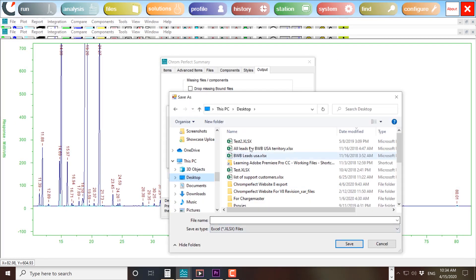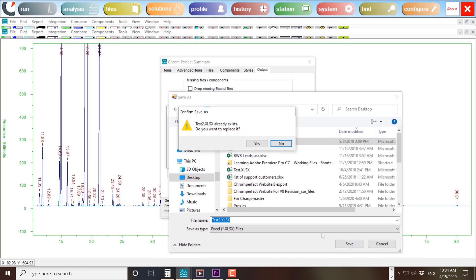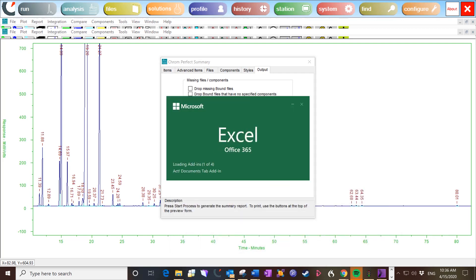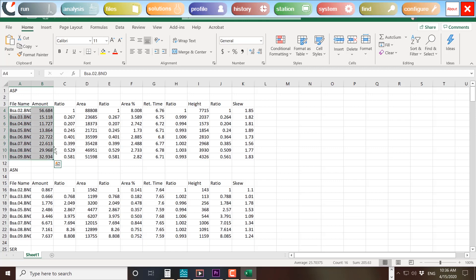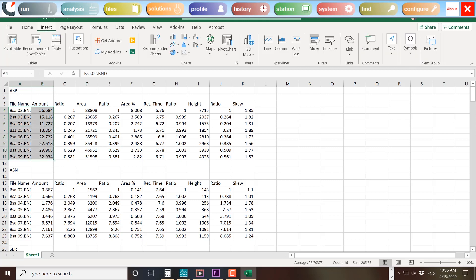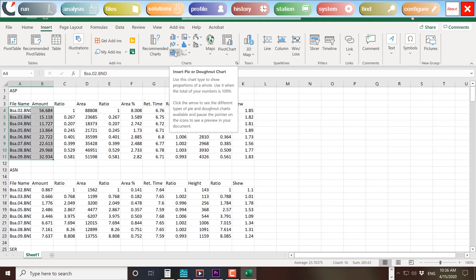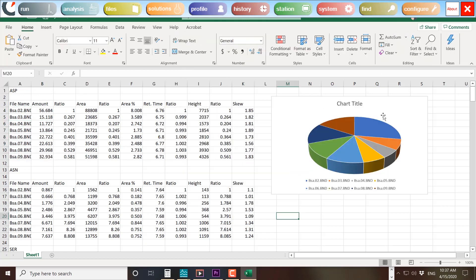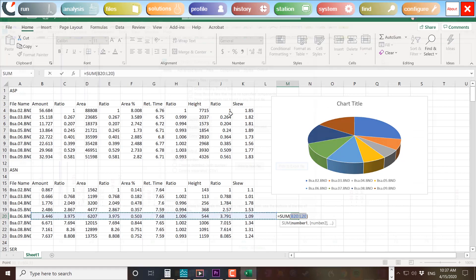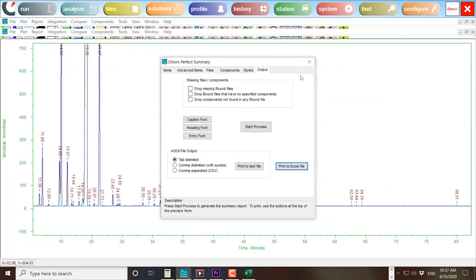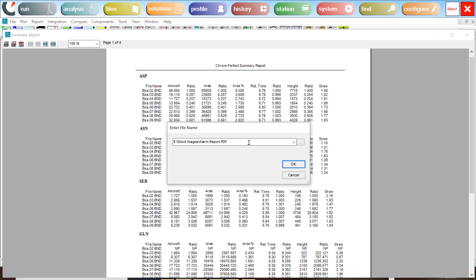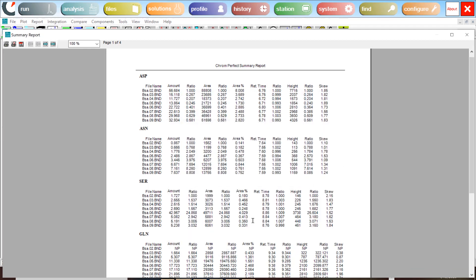If you need even more processing power, summary reports can now be saved natively to an Excel spreadsheet for further data processing and graphing. Summary reports, like all ChromePerfect data, can easily be shared to a wider audience of colleagues or customers with a PDF.